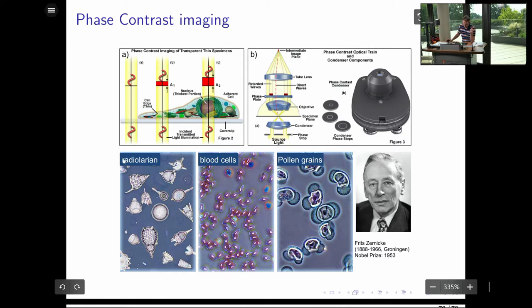Let's have a coherent illumination of a cell. The cell contains lots of different stuff inside. So all these waves of the transmitted light are in phase. And then, as it goes through a certain thickness of cell, for the reasons I just mentioned, the wave is slightly delayed in phase because of the refractive index. In thicker regions, the phase delay is more. It's not very much, it's a fraction of a wavelength, right? And then as the light comes back together, you can hardly see these phase differences on the sample.